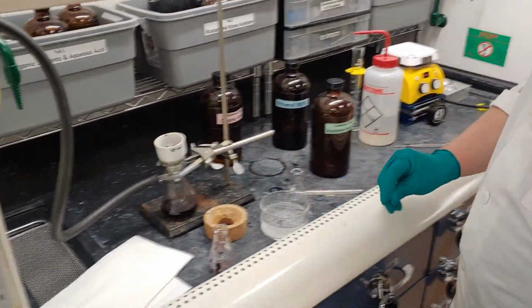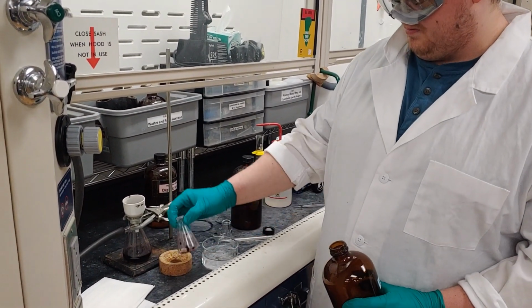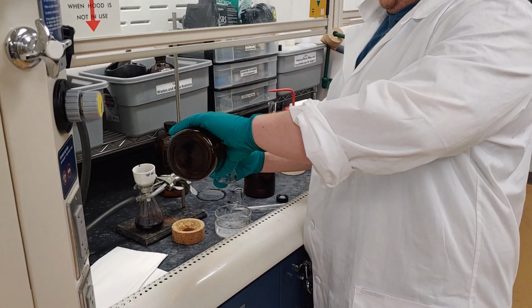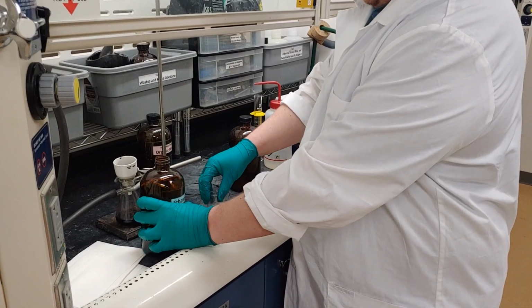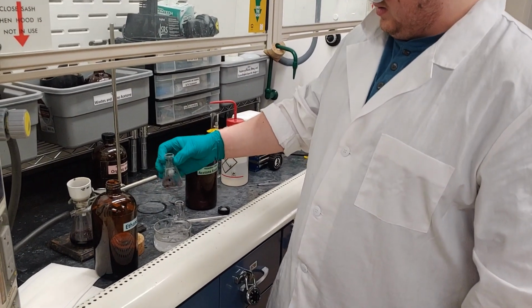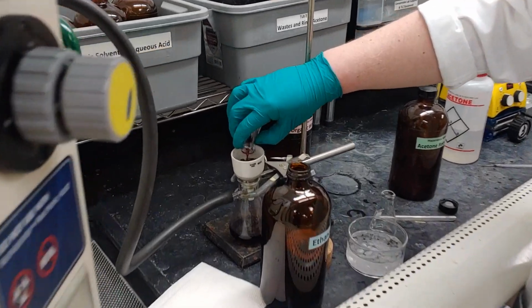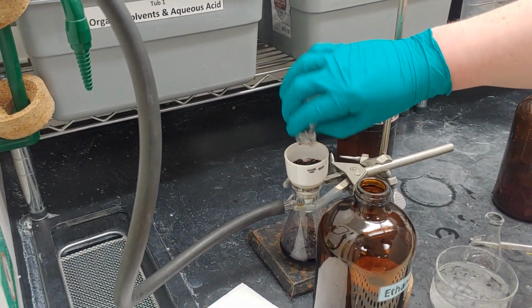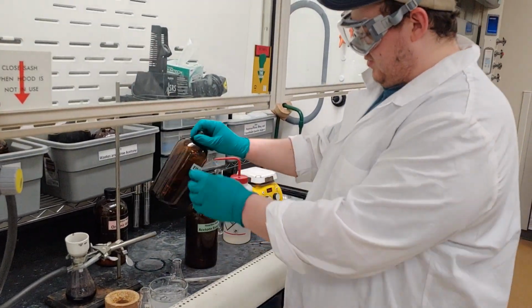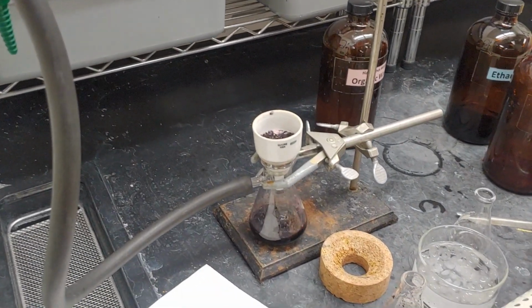Now that most of my product has been poured from the flask, but not all of it, I'm going to rinse it with a small amount of ethanol. Before I do that, I want to make sure it's cold so that as much as possible stays out of solution rather than being in solution. I'd call that about good. Now I want to leave the vacuum on for about 5 minutes to allow the product to dry.